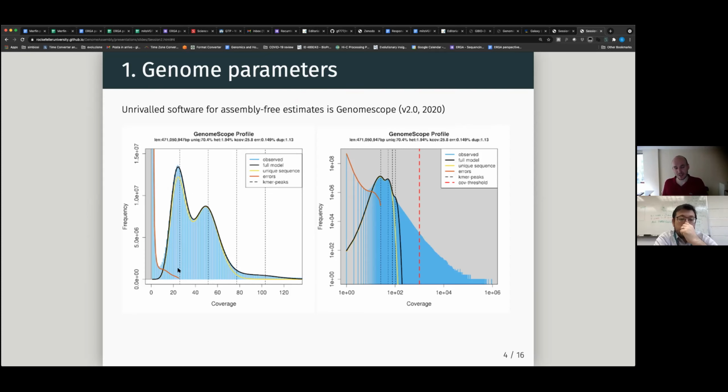Normally, this peak can be very low. If you take an inbred individual from a colony in a lab, for instance, this is going to be near 0, because they are all almost genetically identical, and therefore the heterozygosity is close to nothing. But here it's almost 2% heterozygosity. So this is huge. This is definitely from some wild, healthy population, because as you know, the heterozygosity is also linked to how large the population is, and therefore also how endangered the population is.